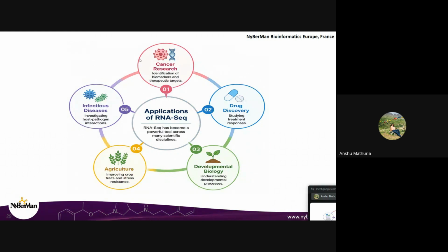One is suffering from leukemia, the other is also suffering from leukemia. So now what you can do is sequence both of them. One has undergone chemotherapy, the other has not gone through chemotherapy and is just taking some medications. So you can understand the difference in the transcript level at that stage as well. You can make numerous combinations. You take only one individual, and get sequencing of that individual before chemotherapy and after chemotherapy. Again, you have two contradictory conditions. So you can make tons and tons of conditions and understand different aspects of a study.